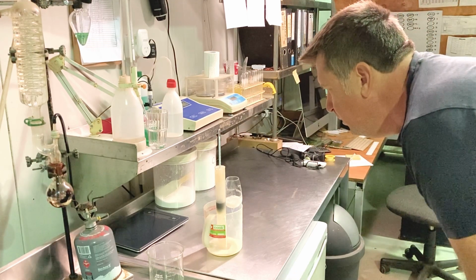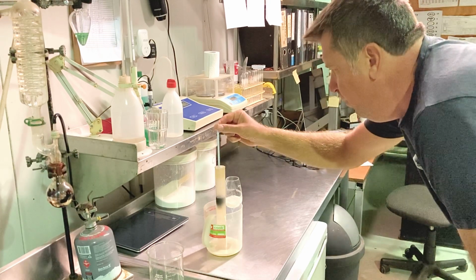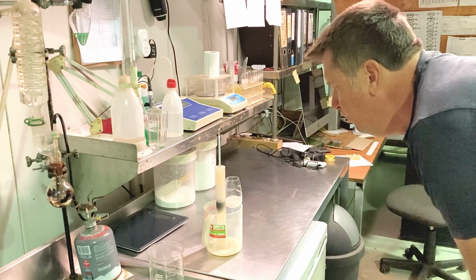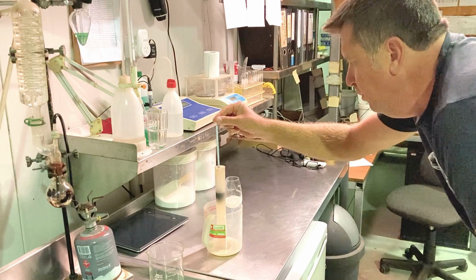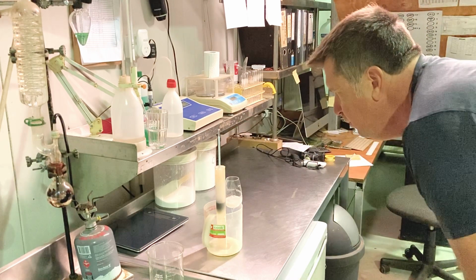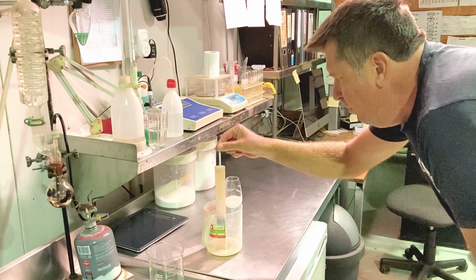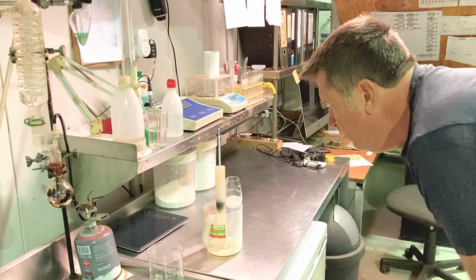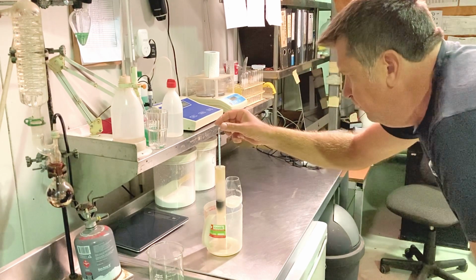The reason we do this is that we're monitoring the sugar level and also the alcohol of our part fermented wine. We're trying to get a long, slow, cool ferment. So we'll do this morning and night to each wine that we've got fermenting to see how it's changed over the day. If it's going too fast, we will reduce the temperature of the vat, so to slow that reaction down. If it's going too slowly, we'll just increase the temperature a little bit, so to speed the reaction up.